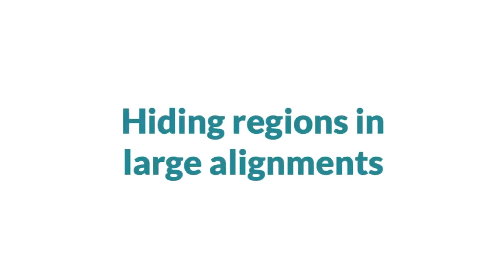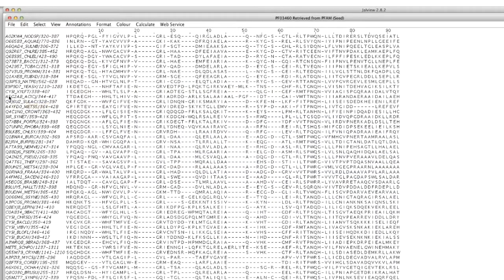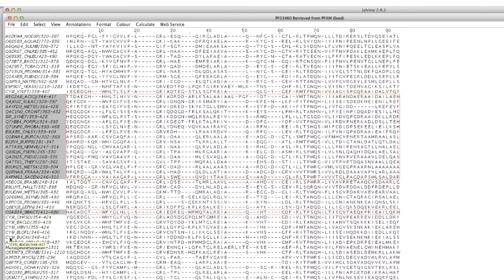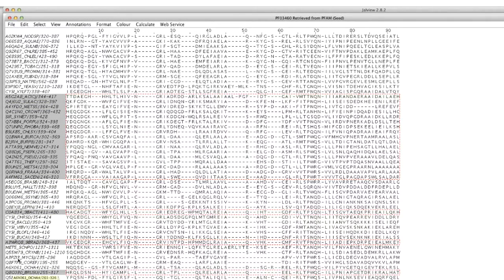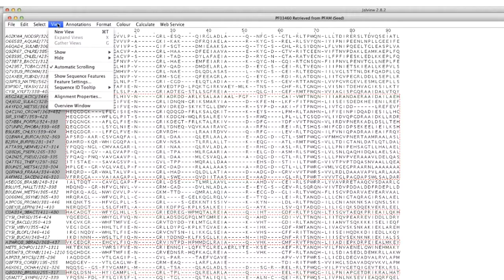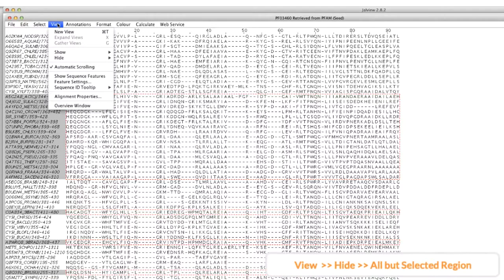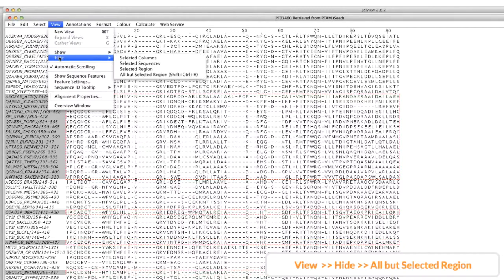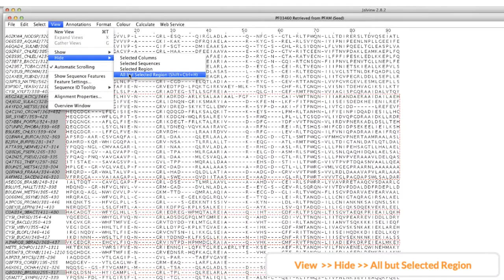With large alignments, it's often easier to select the region you want to work with rather than selecting the regions you want to hide. In this situation, I would select my region of interest, then go to the alignment window menu, select the view menu, and select the hide option. I then select all but selected region.